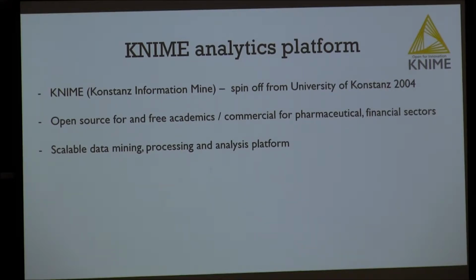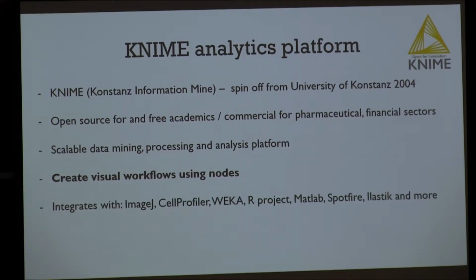It's very scalable, and it's an analysis platform. The idea is that you create visual workflows using nodes, all right? And it integrates really well with Cell Profiler, ImageJ, Ilastik, as I've talked about, but also MATLAB, TIBCO Spotfire if you use this for analysis, and of course R. It's Java-based, but you can also run Python code and snippets within it if you want to.